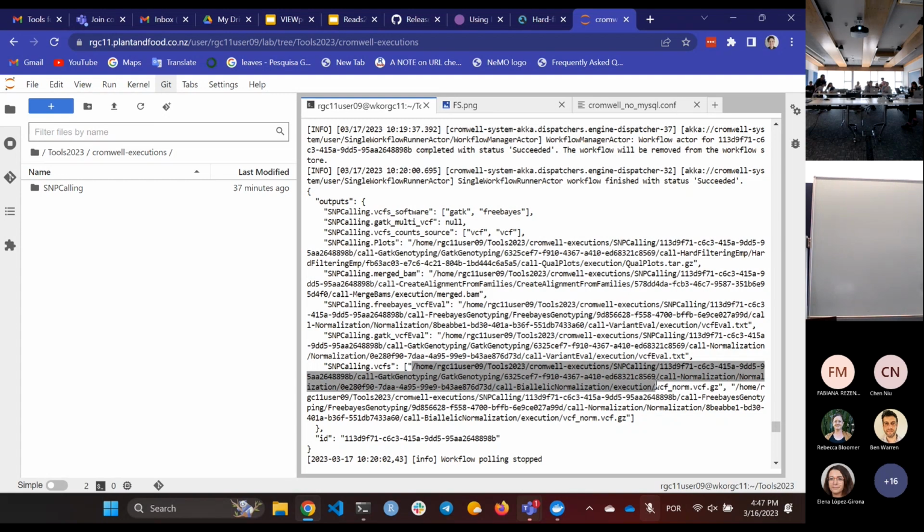All right, so that's the VCF. Did they go too fast? Okay, sorry.